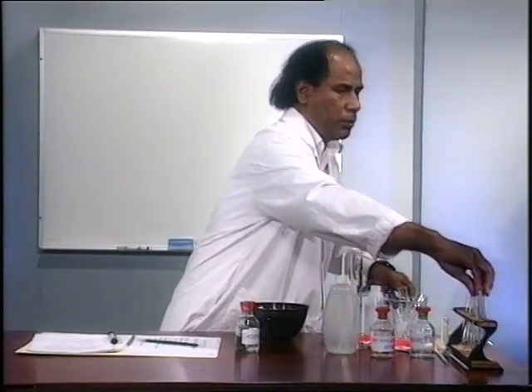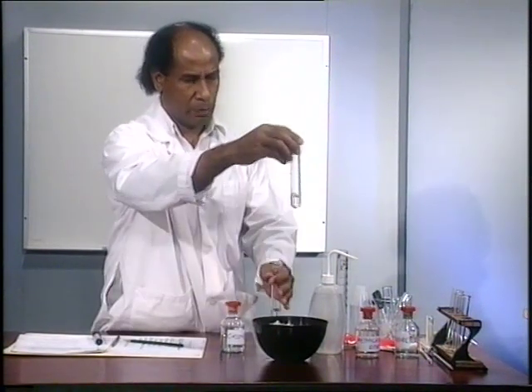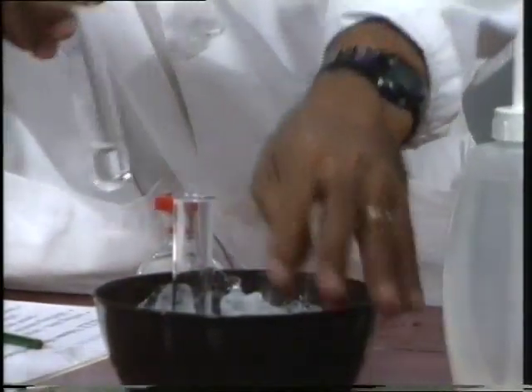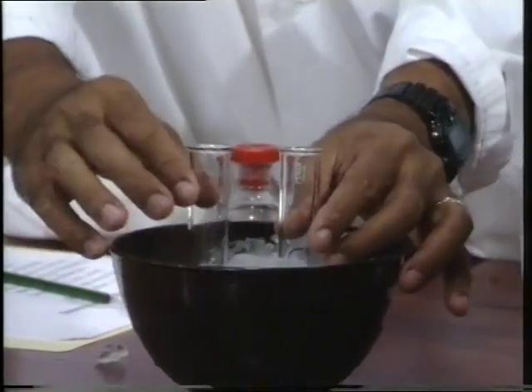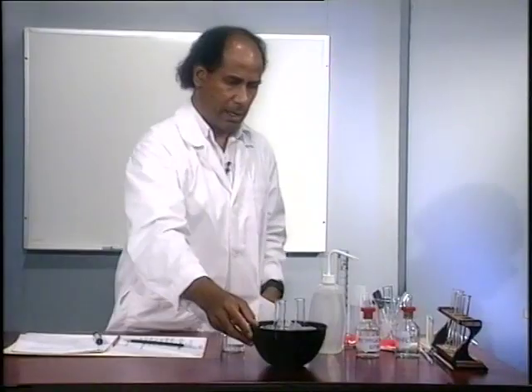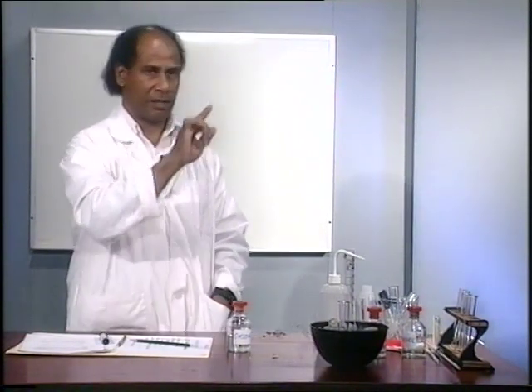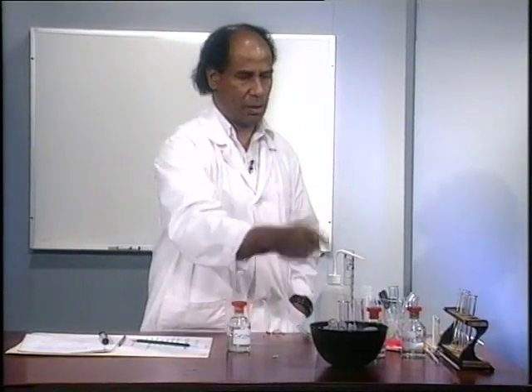and then you will take your two boiling tubes, and you will place the boiling tubes in the freezing mixture. All right. Now, something that's very important here, I'd like you to note, is that you will notice that I have these two boiling tubes upright, vertical. That is very important because if you have it slanting, then you won't be able to see your mark or to use that mark that you have placed. So the tubes should be vertical, upright in your freezing mixture.